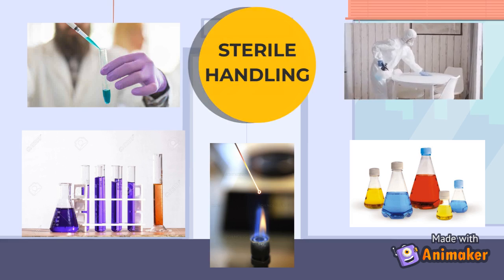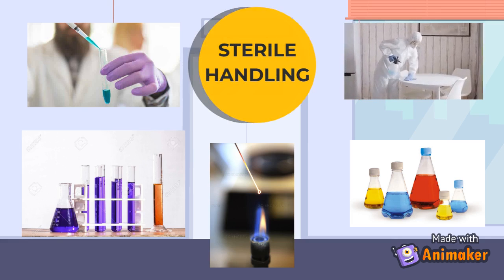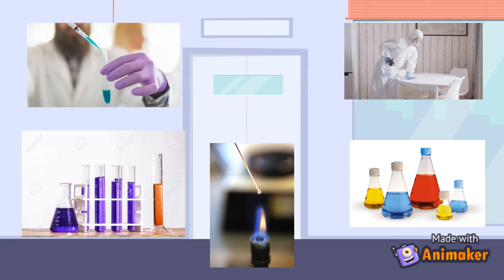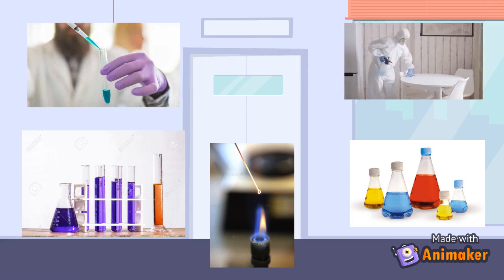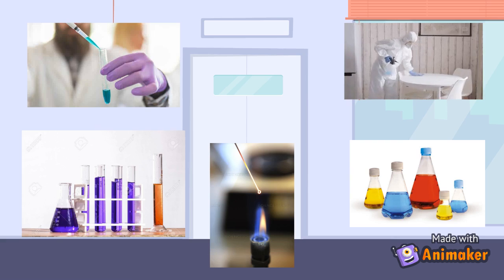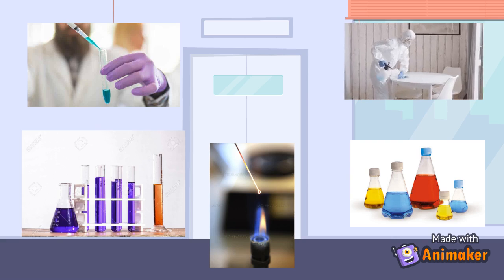culture. There are some procedures that need to be taken seriously. First, swabbing. Second, capping. Third, flaming. Fourth, handling bottles and flasks. And lastly, pipetting.